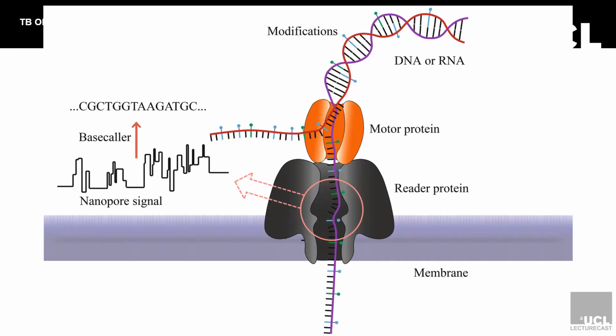The fragments will be barcoded. So when it's going through, the barcode will also be read, and that helps you know which sample that particular read belongs to. And once you get the fragments from your various samples, those fragments are then overlapped when you use your bioinformatics to build up the consensus sequence that you're going to get at the end.